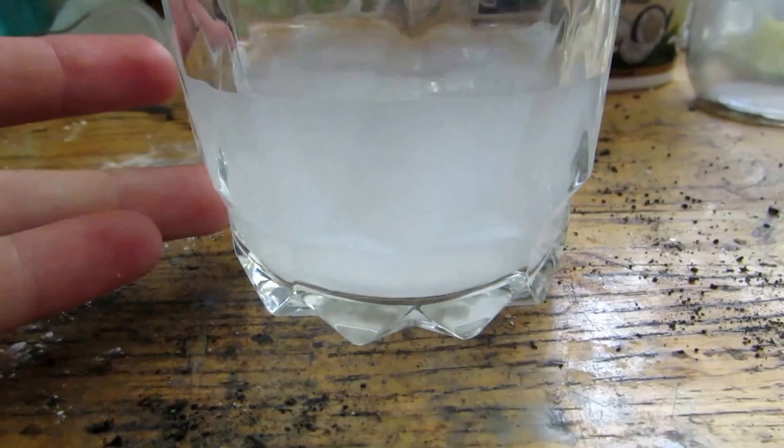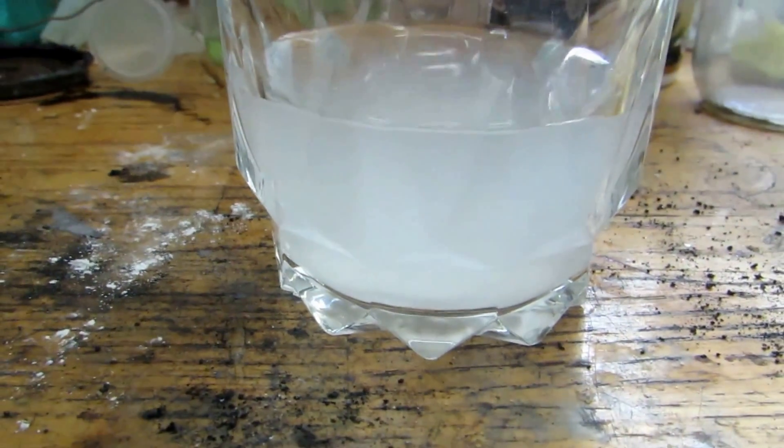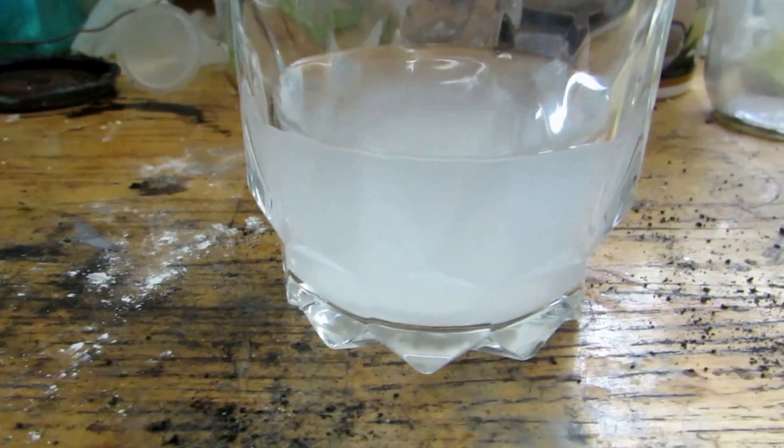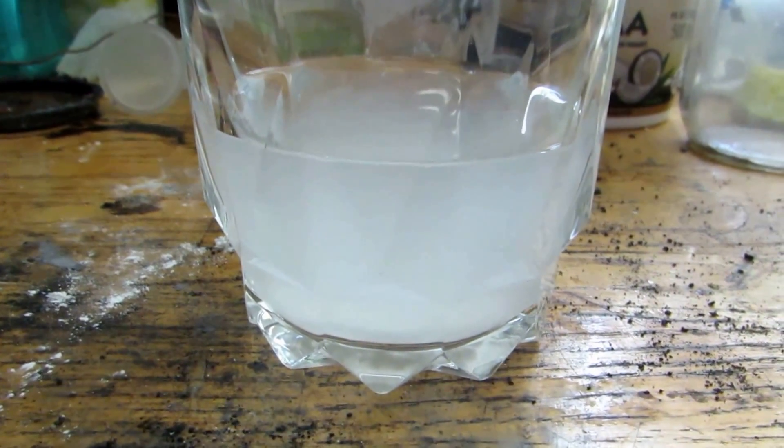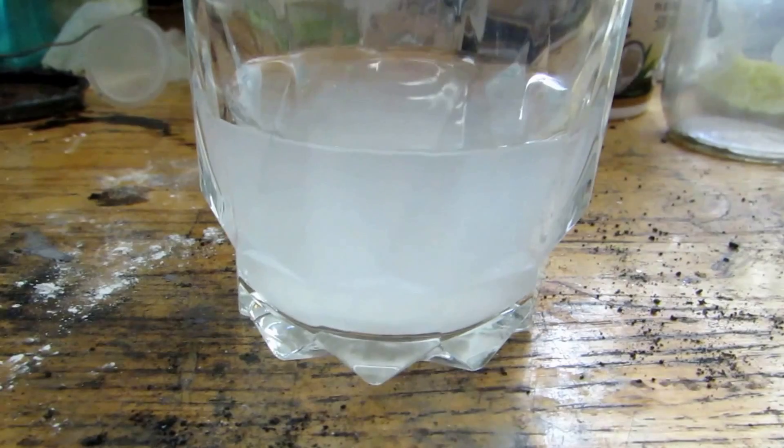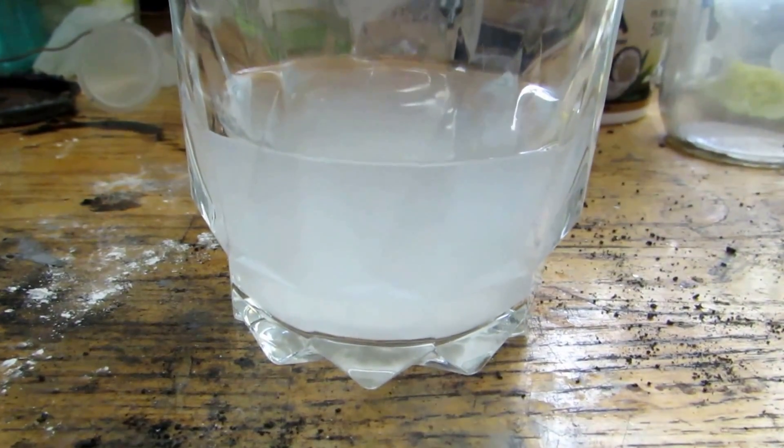But first we're going to filter off whatever's insoluble here. Then we'll be left with our solution of pretty much mainly just strontium chloride, which is what I'm hoping. Then we'll be able to boil that down and get the pure crystals. So I'm going to try to do that and I'll be right back.